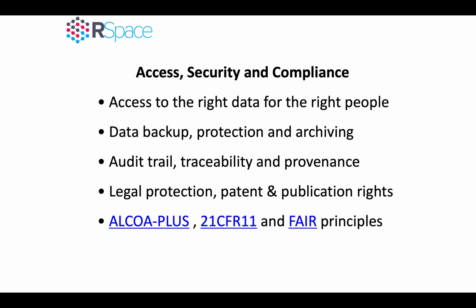Naturally, RSpace also includes a range of compliance features to make sure that your work is properly recorded and protected. RSpace follows ALCOA Plus, 21 CFR Part 11, and FAIR Data Principles guidelines. This means that your data is always recorded in a way that represents a true and accurate record of the work performed in the lab.